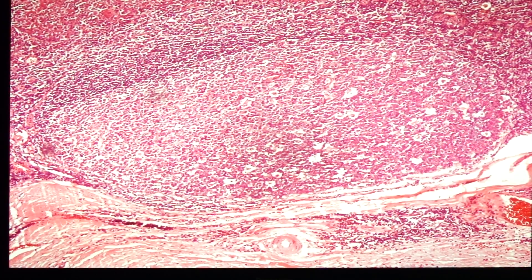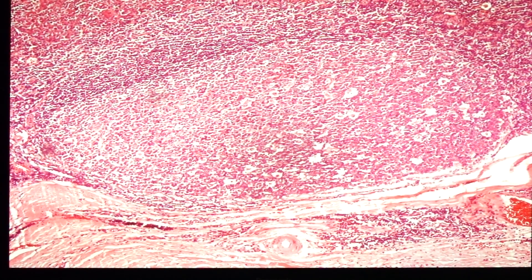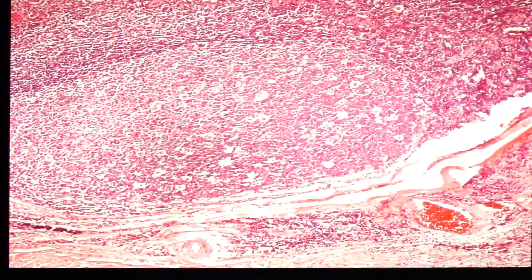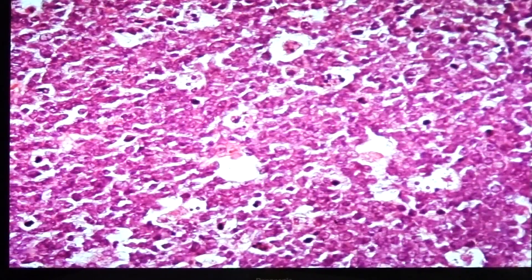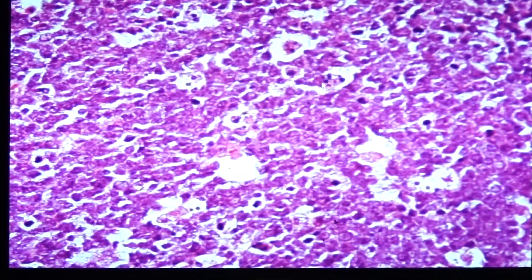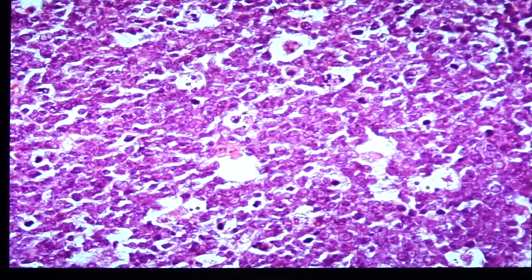Here is another secondary follicle. In this particular follicle, you can identify the presence of the mantle zone. Within the germinal center, you have the presence of tingible body macrophages. At high power magnification, these tingible body macrophages are visible — they eat up the fragments of dead lymphocytes or dead cells within the area, and they are identified by having abundant cytoplasm.